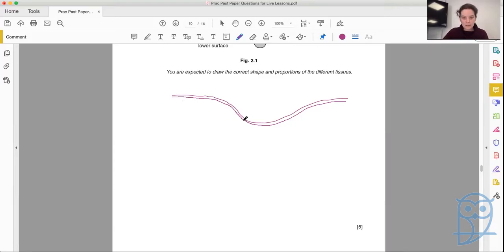Okay, then in the middle, we have a bit of a bobble. And then from here, we go across again. So there's a whole lot of cells in each of these zones. Okay, there's your palisade cell zones. So you can see them, longer, taller, thinner. Okay, column-shaped cells. Okay, but we're not drawing each of those cells. We are just drawing the lines where the different cell type changes, because that's the edge of a tissue. So a plan diagram is always about the tissues.